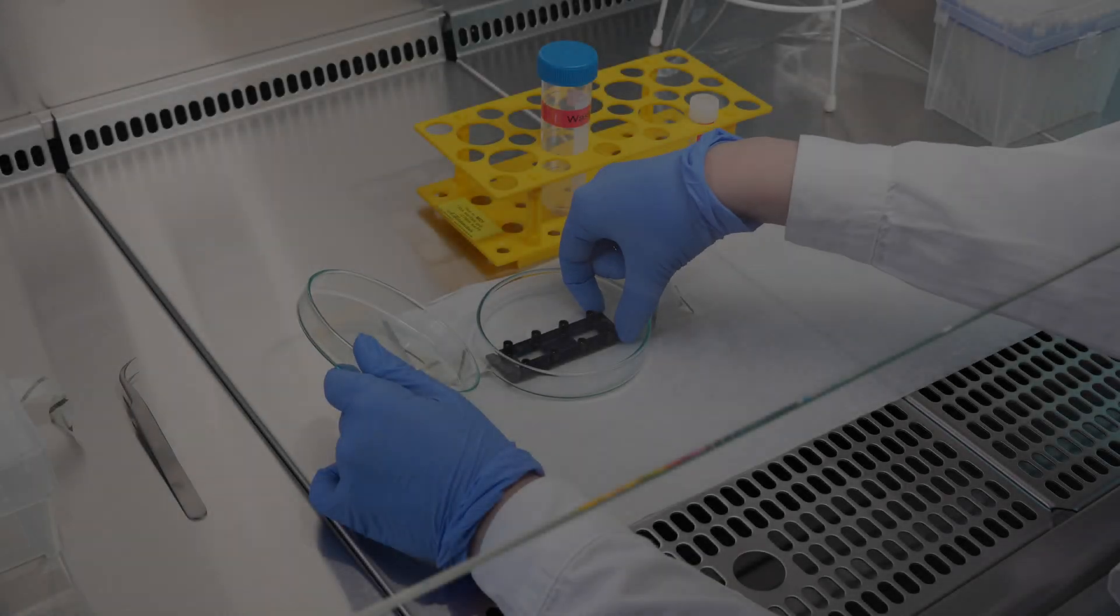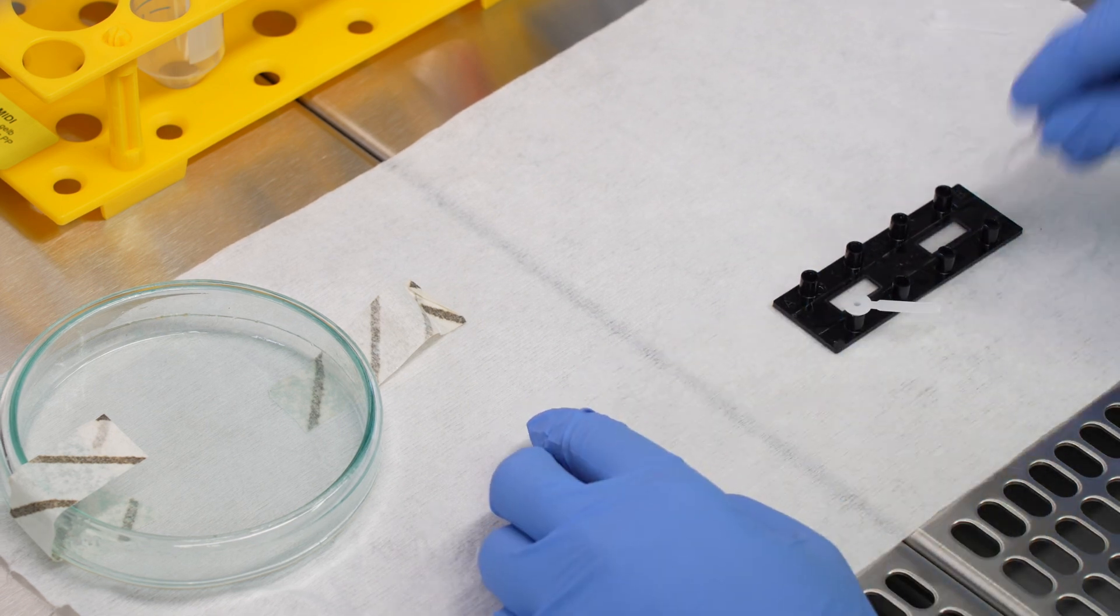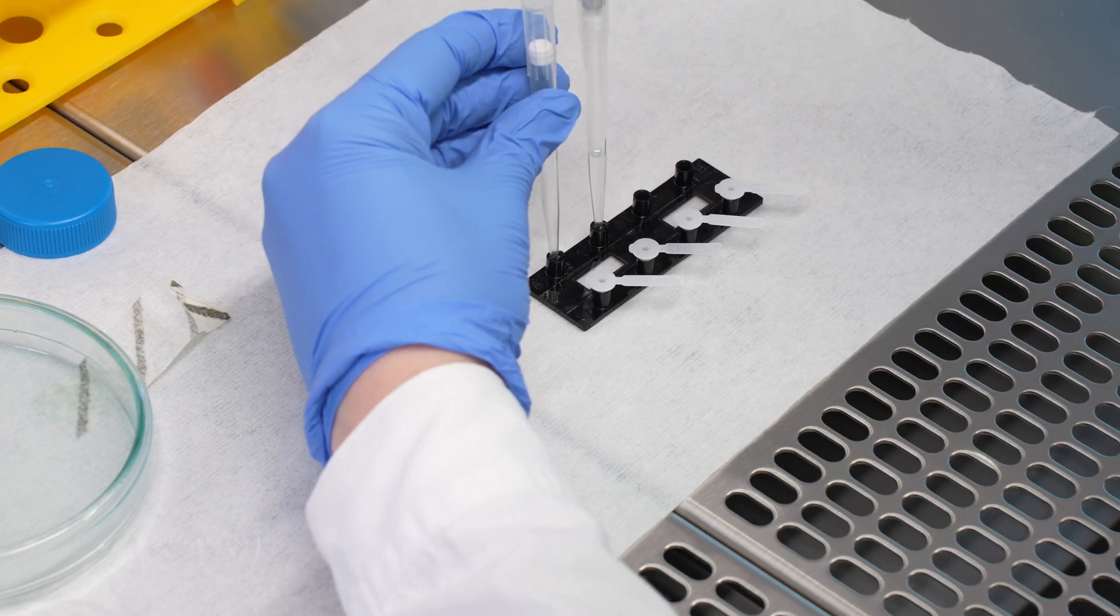The second step is coating the biochip membrane to prepare for cell seeding. Coating solution is applied to all channels used for cell seeding and incubated as usual.